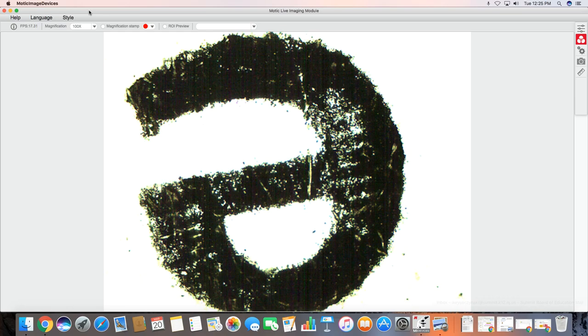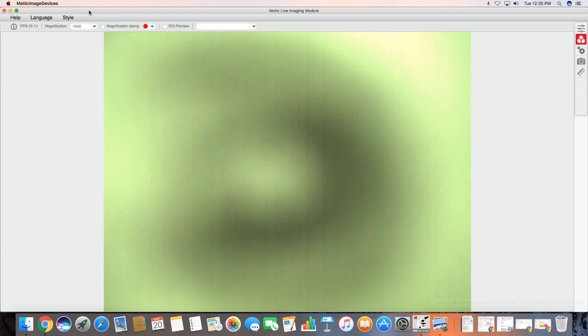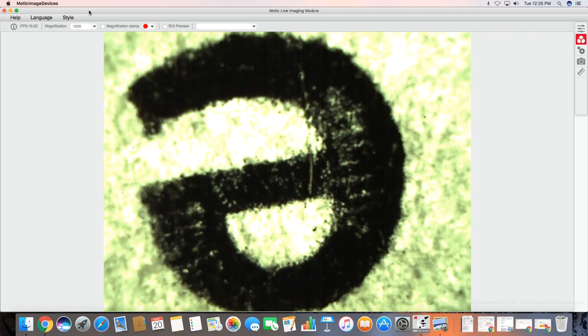So again I found my E in the red scanning lens. I'm going to zoom out a little bit so you can kind of see what it looks like to find the E. When I put the E under I had to zoom in with the coarse knob until it comes into focus.